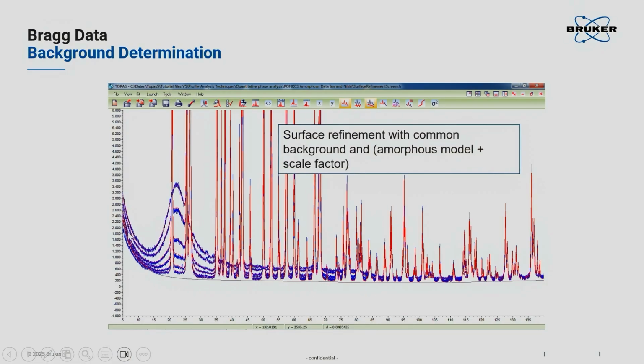And of course, the instrument background does not change if the amorphous content changes. So all the intensity underneath the measured intensities for the various amorphous contents is a small angle X-ray signal, and that, of course, in size also changes with the concentration of the amorphous phase. So this is not to be confused with air scatter. That's the point I would like to make. The air scatter part is here. This all is small angle X-ray scattering.